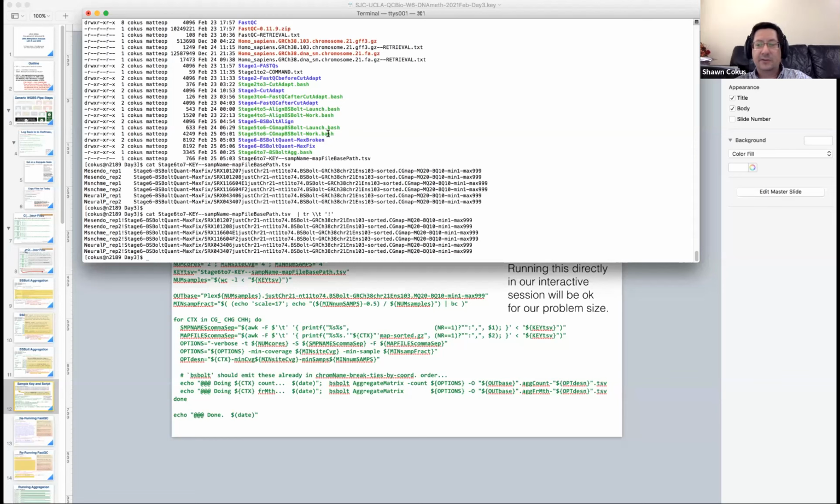If you compare those two, you'll find there's a few lines different in this. So we deleted some sites where the coverage was in excess of 999. We'll see today that 999 is higher than it should be; we should probably use a smaller number than that. But we know that after we'll do some stuff in R. So that's the directory where the CG map files are.